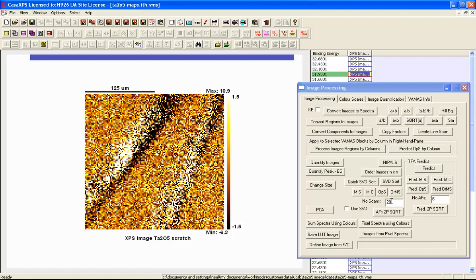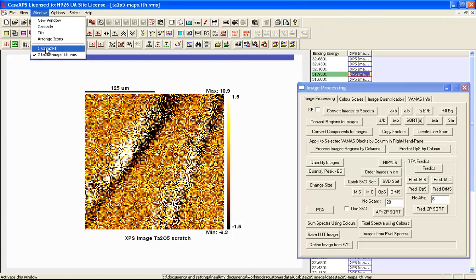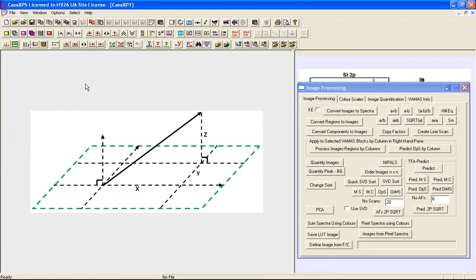That projection operation needs some explanation. Each image in this data set is considered to be a vector, and the PCA performed on these vectors is a vector operation. To understand what we mean by projection, it's worth looking at vectors in a three-dimensional space defined by three axes i, j and k.